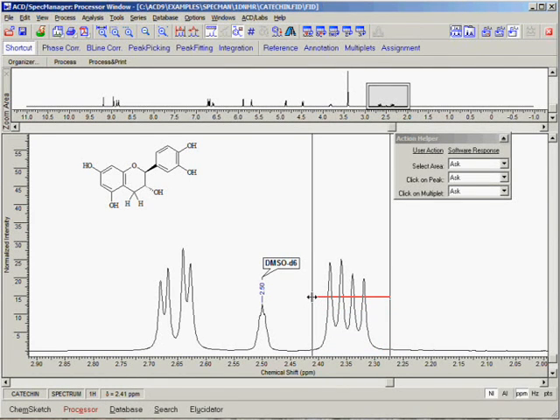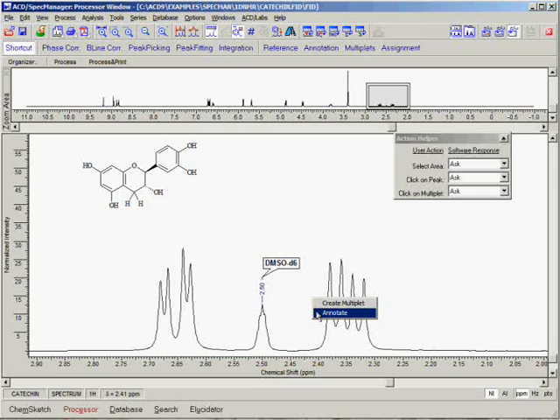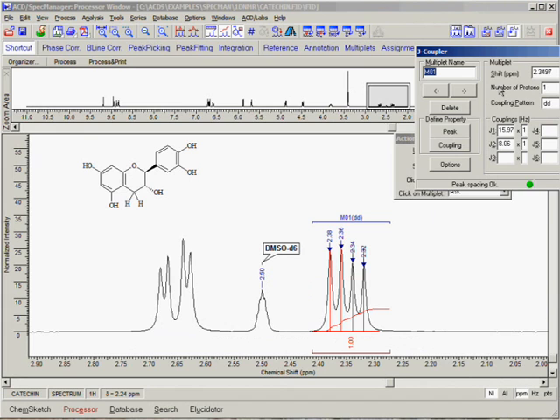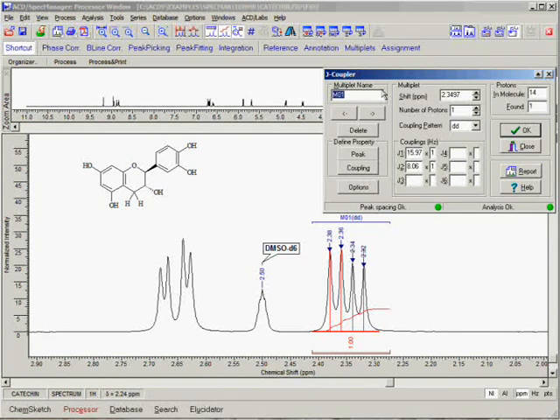When we are satisfied with the peak level threshold, we release the left mouse button and are once again given the option to either annotate this region or create a multiplet. In this case, we select the Create Multiplet option and the multiplet is automatically created. Note that a new dialog box appears which is referred to as J-Coupler. This box provides all the multiplet information for the currently selected multiplet. Notice that the software has characterized this multiplet as a doublet of doublets and has automatically determined the coupling constants for this multiplet.